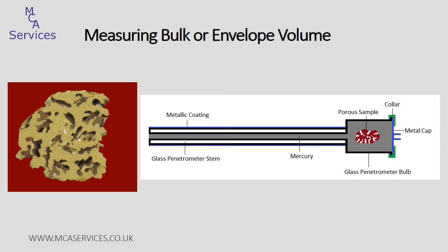We'll show this in greater detail in a following video, and we'll also expand on the measurement of powder samples. And don't forget, we also have 3 videos showing mercury porosimetry in action in far greater detail. So please go and have a look at them as well if you're not familiar with this analytical technique.